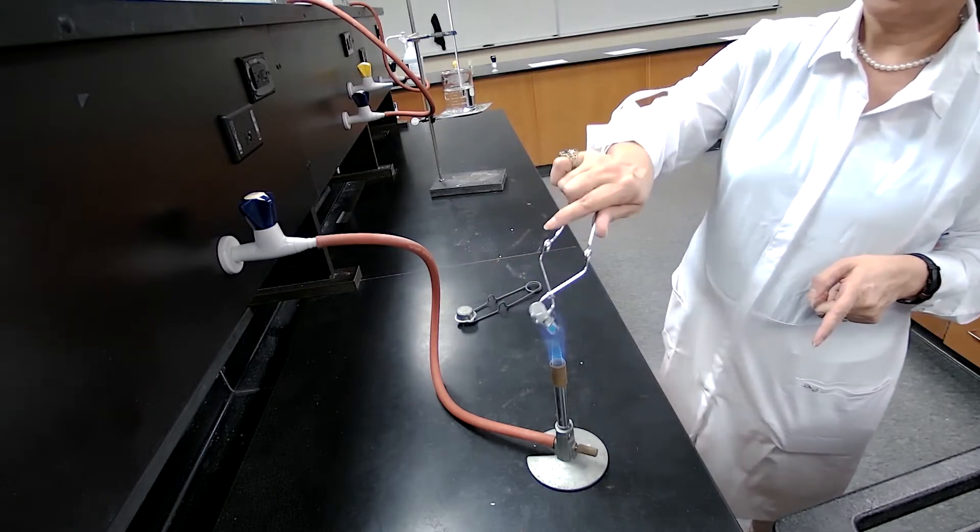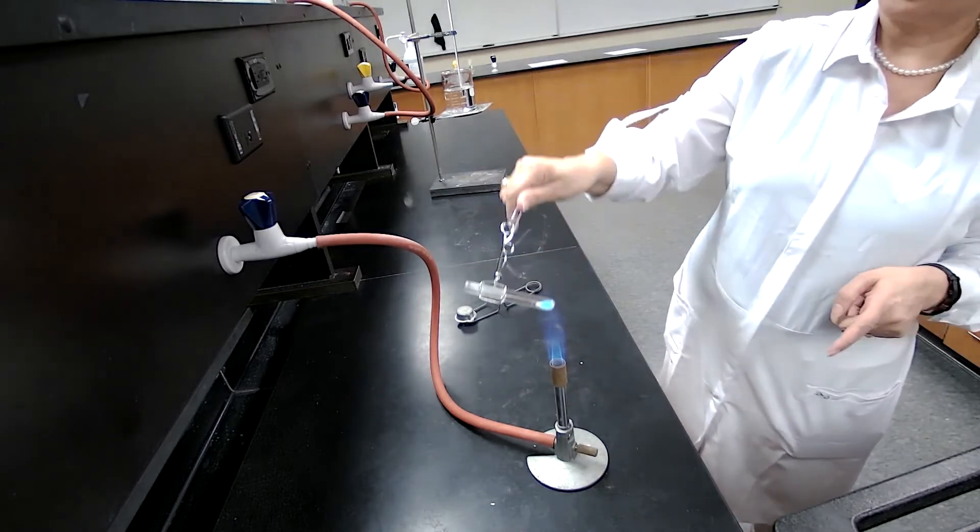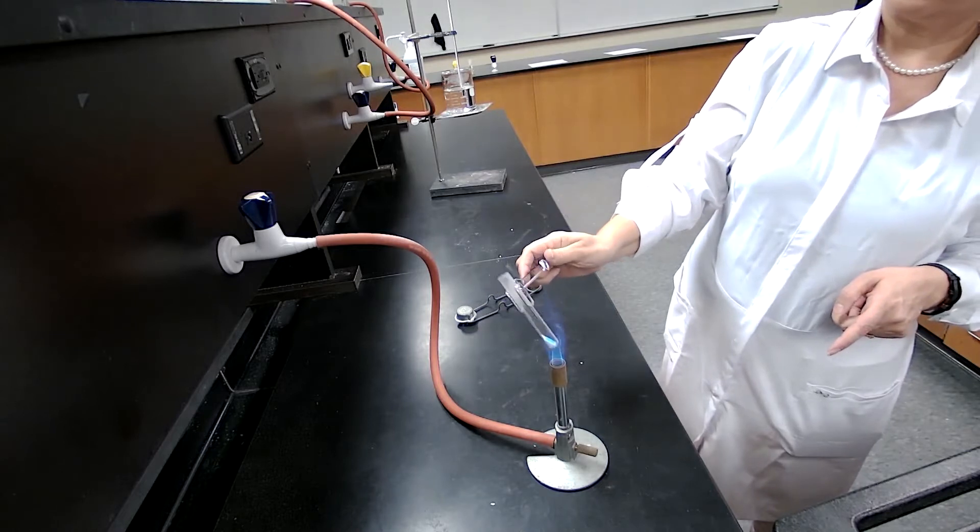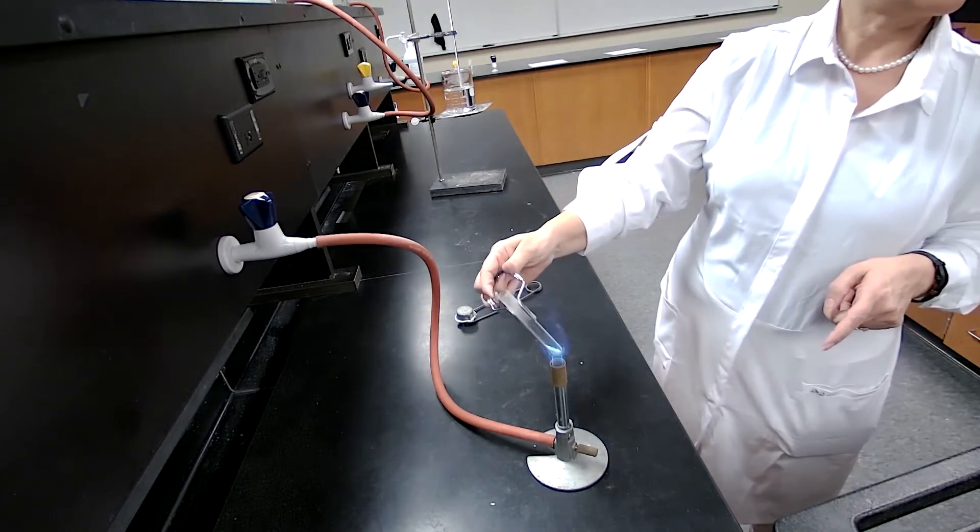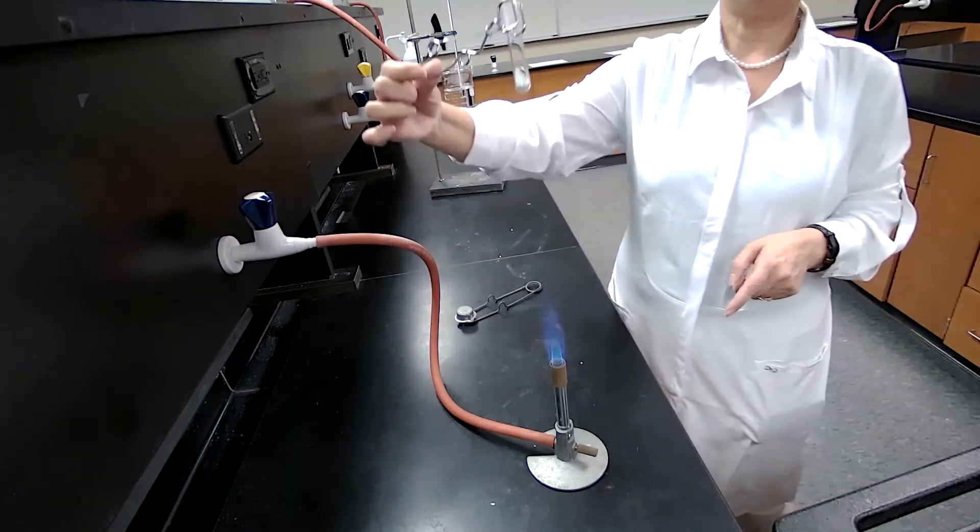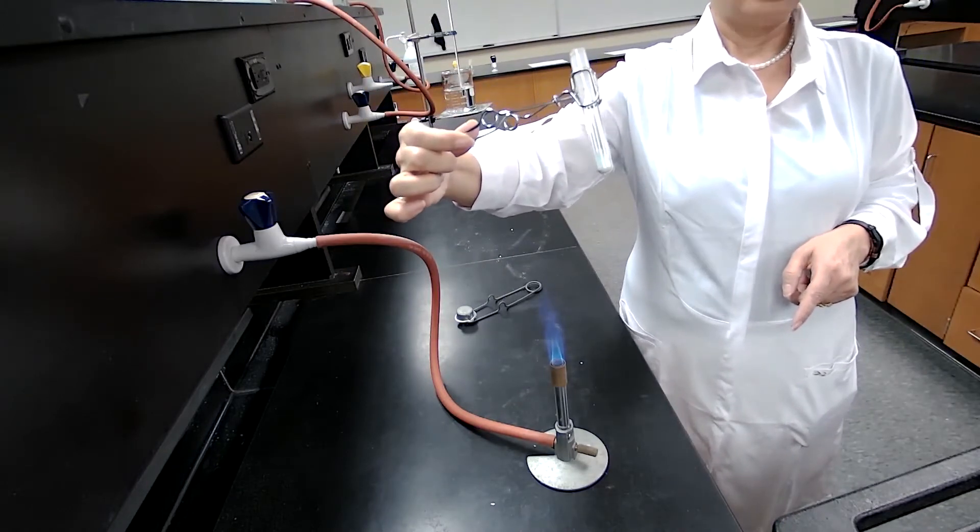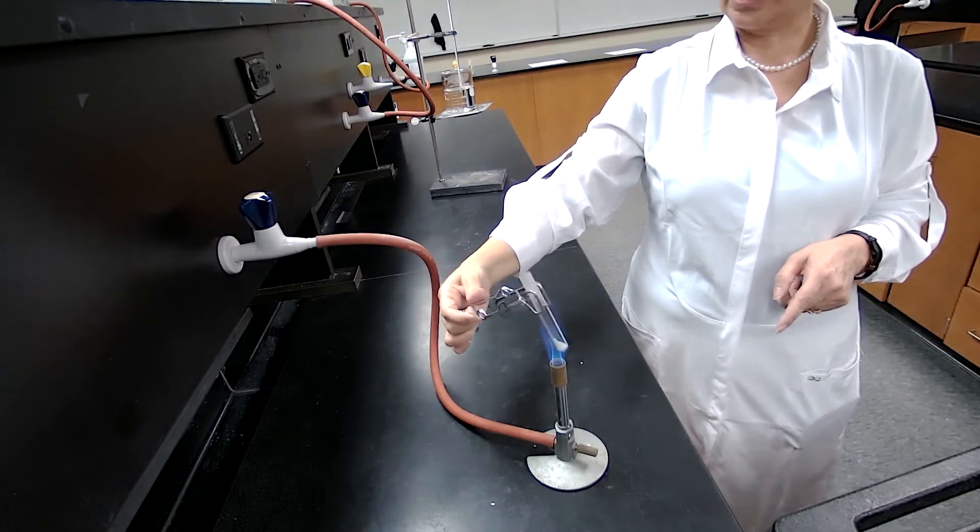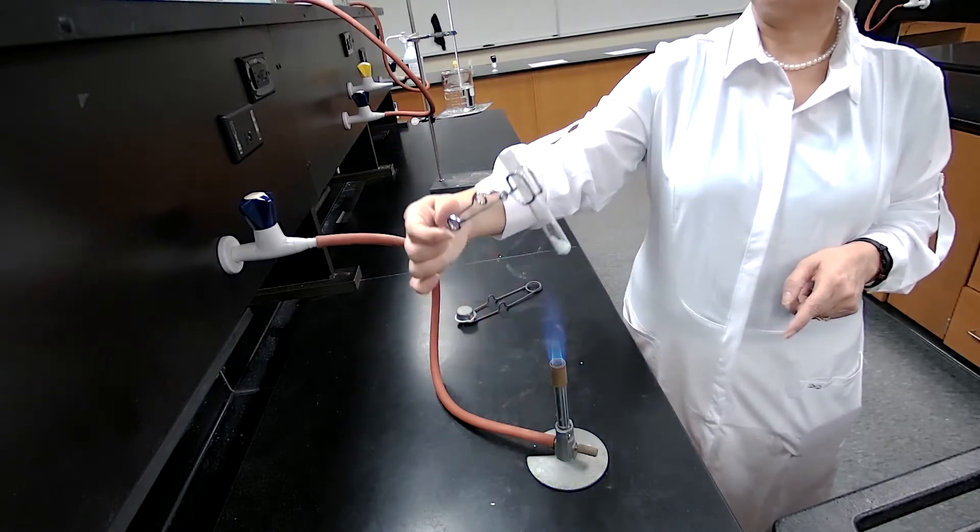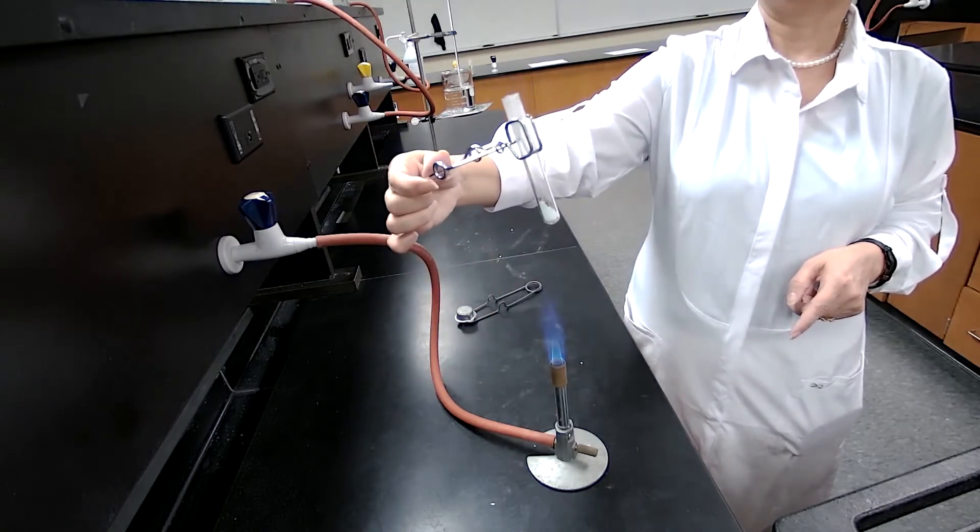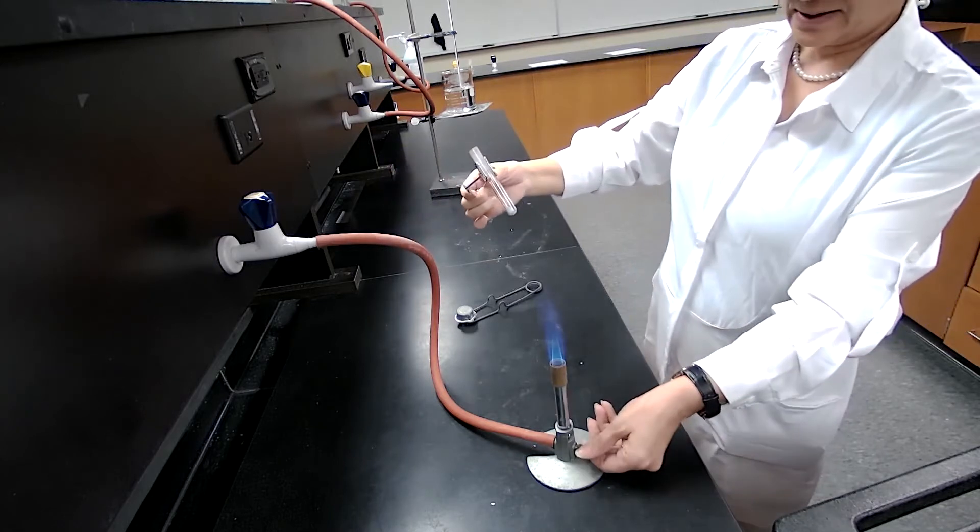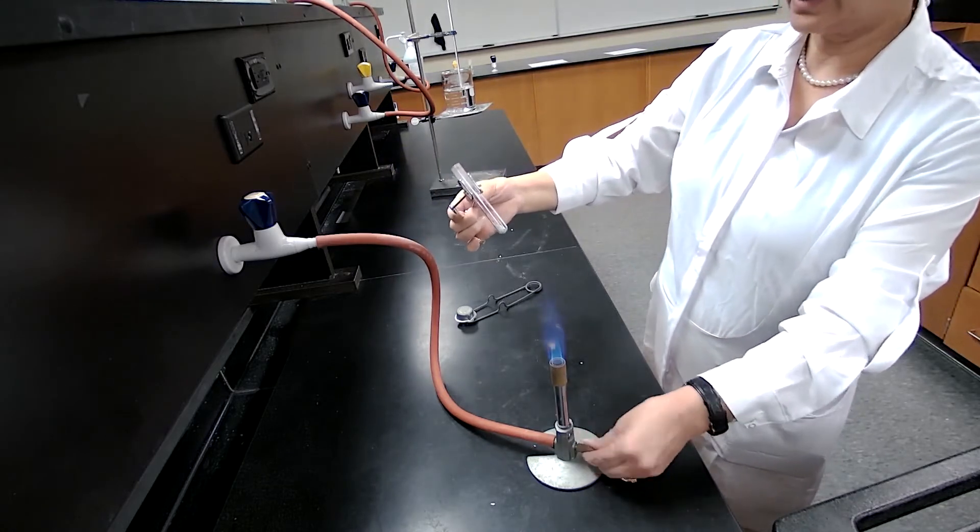And also we see a color change of the sample. So the blue color is disappearing and the white color appears. So there is a color change here and copper sulfate has lost the water.